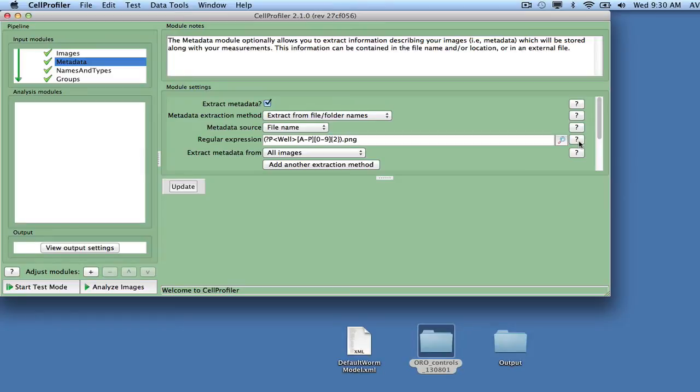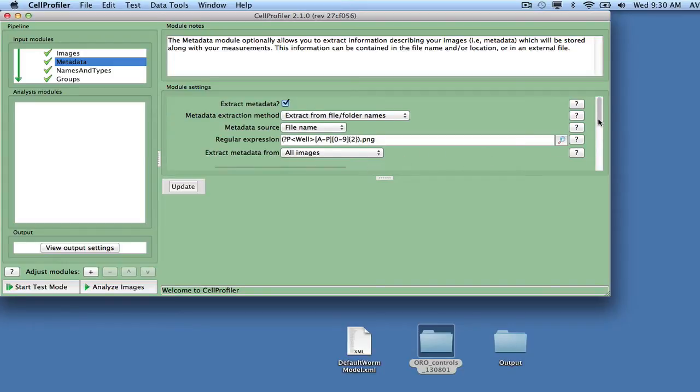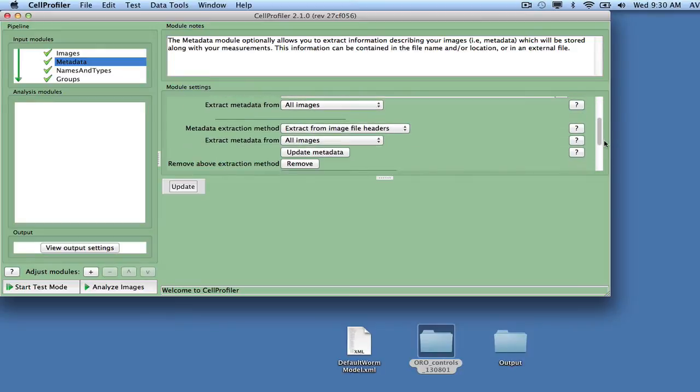To learn more about regular expressions, click on the question mark next to this option in the module settings. Click Add another extraction method, and then extract the plate and gene names from the folder names using regular expressions.